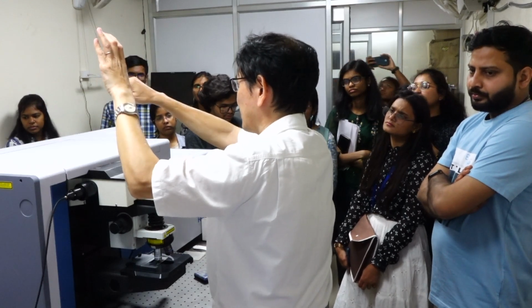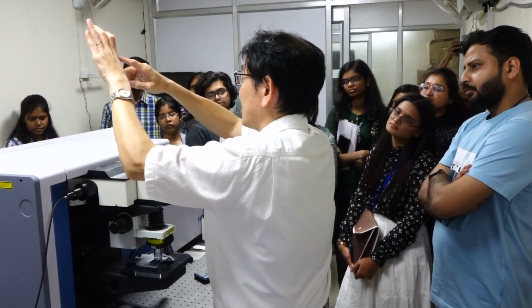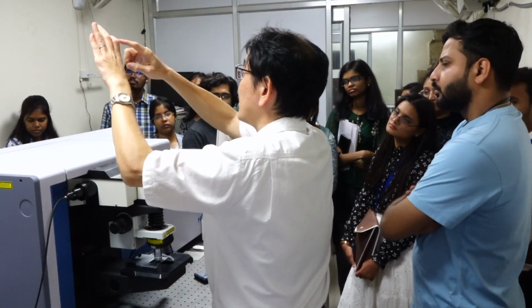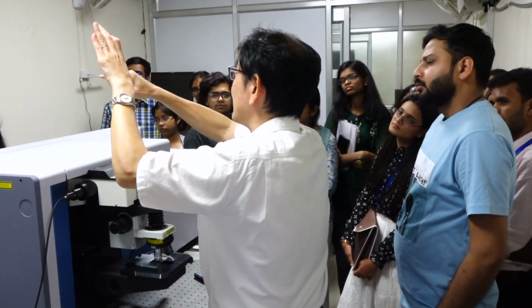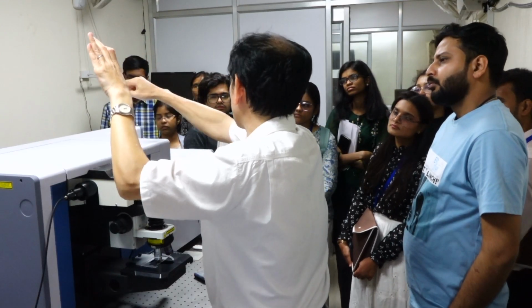So the spectrum of the dichroic mirror is something like this. The vertical axis is transmittance. It transmits some wavelengths, and suddenly it reaches 0: 100, 100, 100, 0, 0, 0.